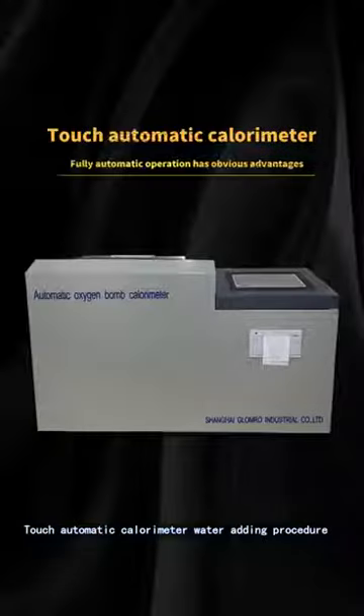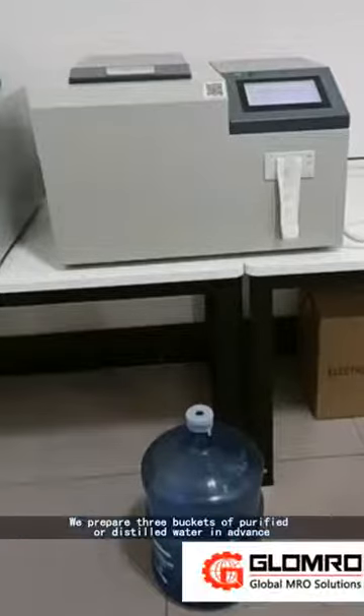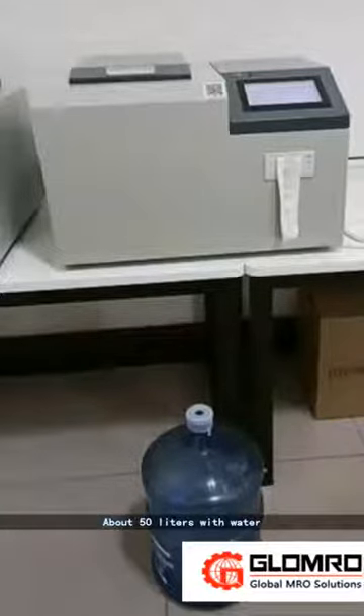Touch Automatic Calorimeter water adding procedure. We prepare 3 buckets of purified or distilled water in advance, about 50 liters of water.